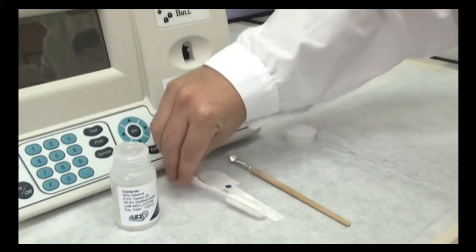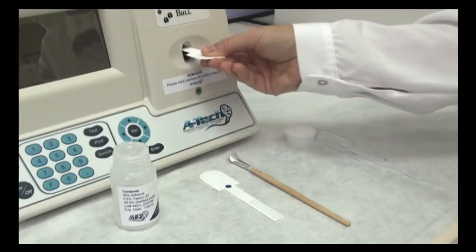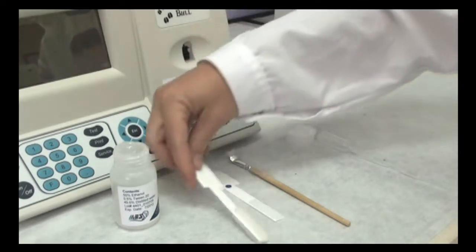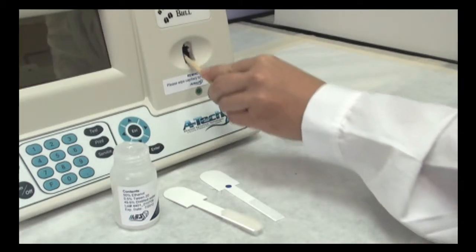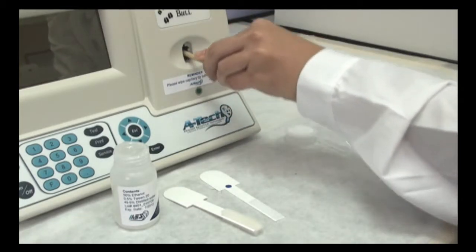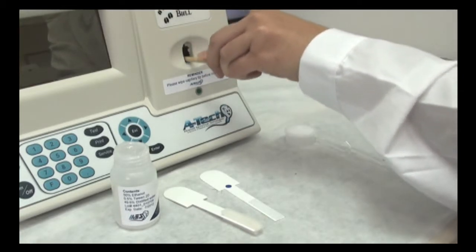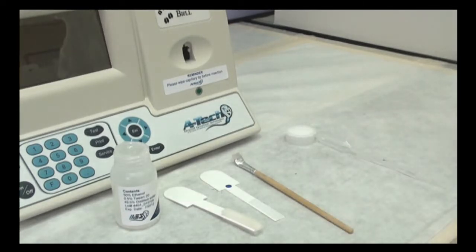To dry the testing chamber after cleaning, insert the spongy drying capillary into the chamber. Give it a few solid strokes as well. Lastly, use the long wooden brush to reach into the chamber and wipe off the small ledge at the top back of the chamber. The bristles should face down and you should pull gently forward as demonstrated.